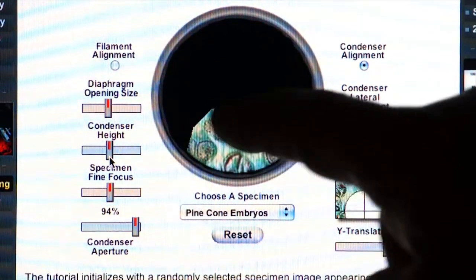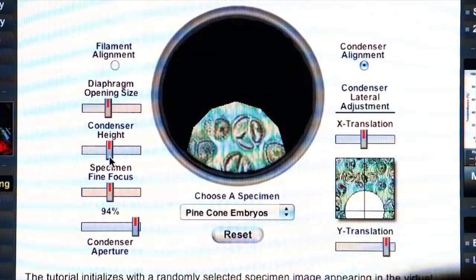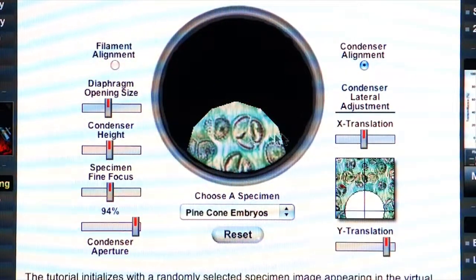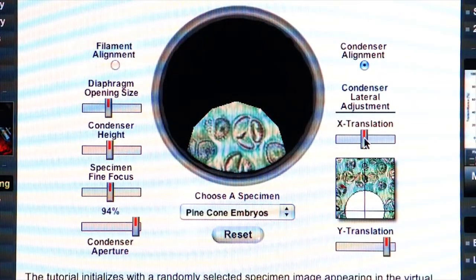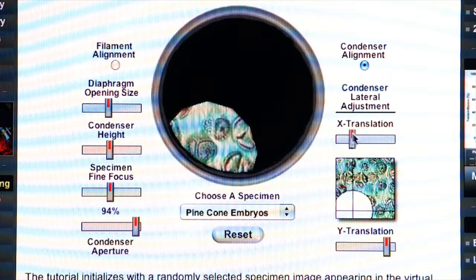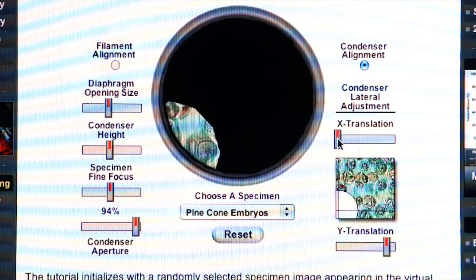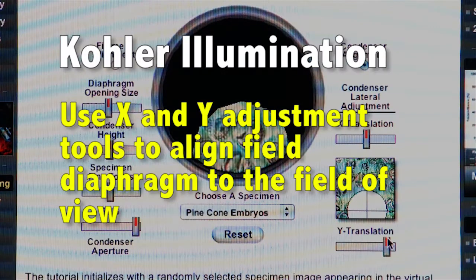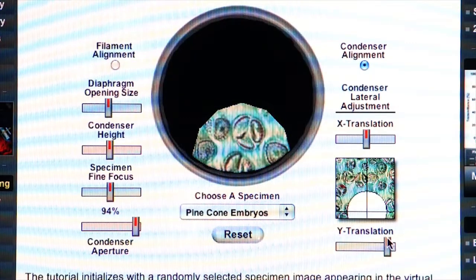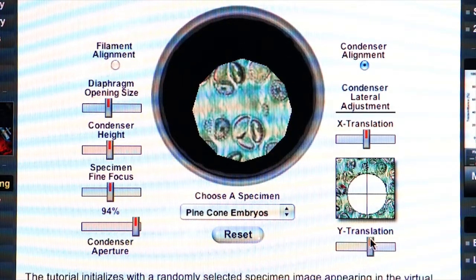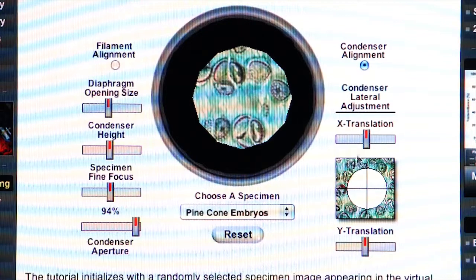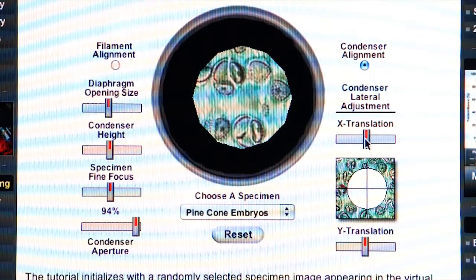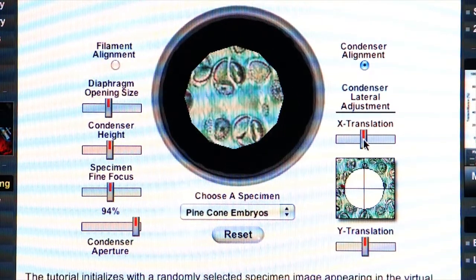But we still have to align our field diaphragm to the field of view. We do that by using the alignment tools on the side of the microscope to move the condenser left and right and up and down. By manipulating these knobs, you align your condenser using the field diaphragm to the center of the field of view.